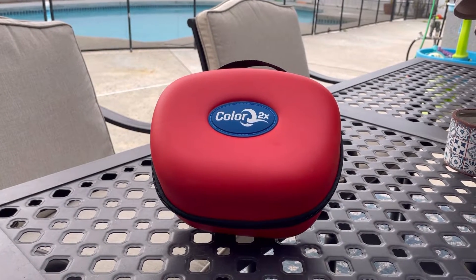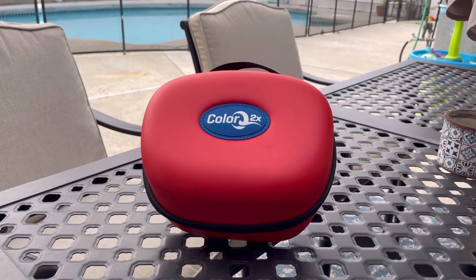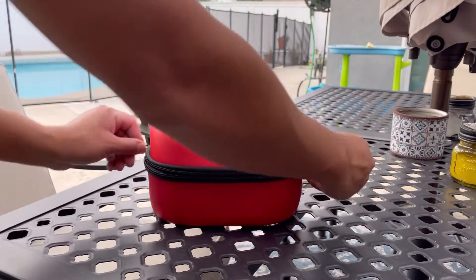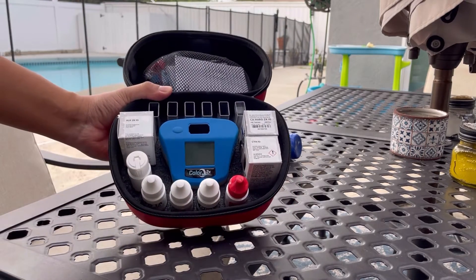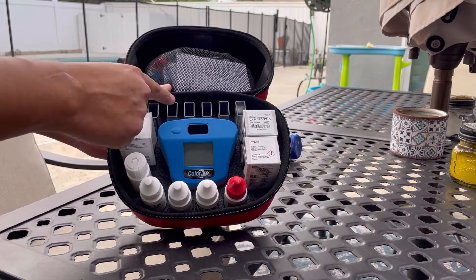Hey guys, here with another video to demonstrate the Color Q2X Pro 7 Digital Water Test Kit. Stay tuned to see what's inside. Let's open it up. All right, and you get the unit itself. You get six test tubes.